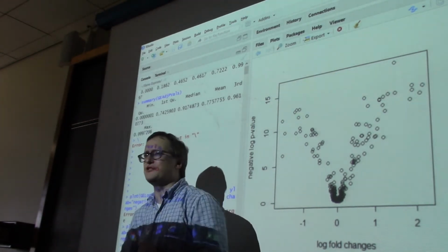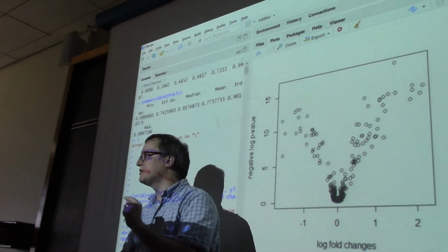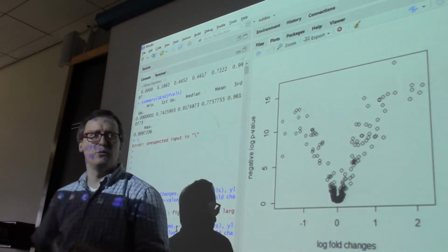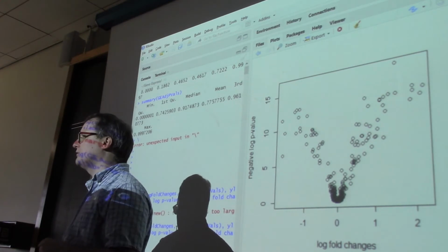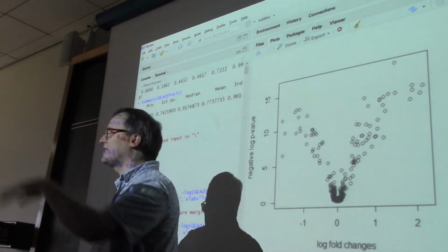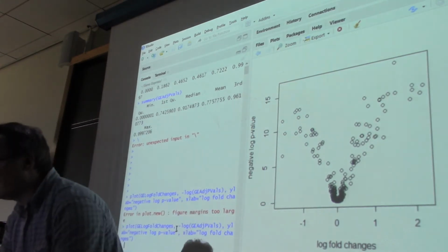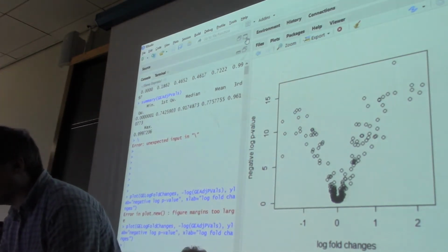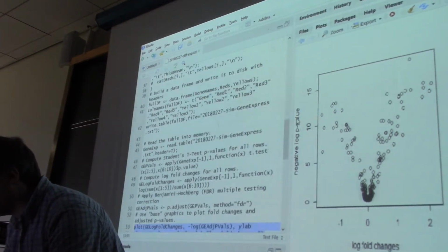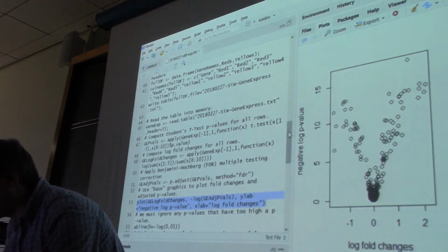There are some limitations to this plot, though, and there are some things that we want to do to fix it up, to make it a little easier to read. So when your professor comes by your slides, he or she can say, oh, I see the stuff I should be paying attention to. So let's return to our source document. There are a couple more lines we want to grab. I'm going to shove this off to the side again. All right.